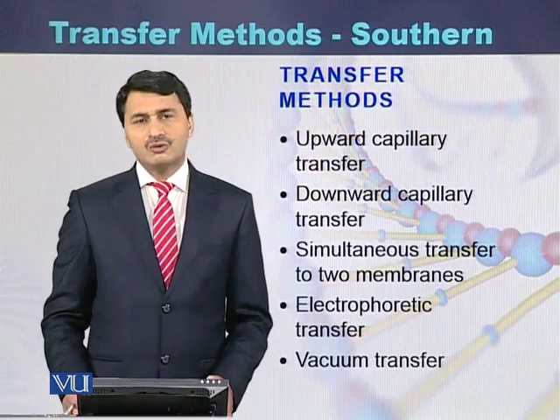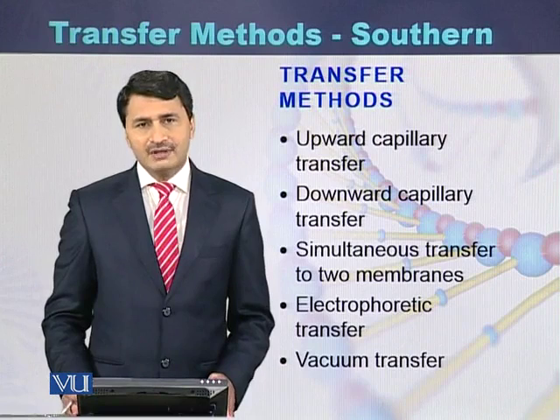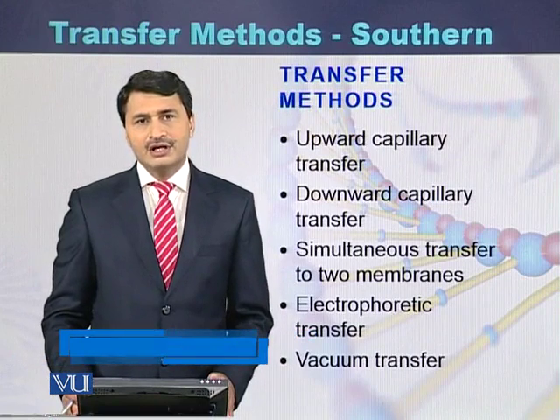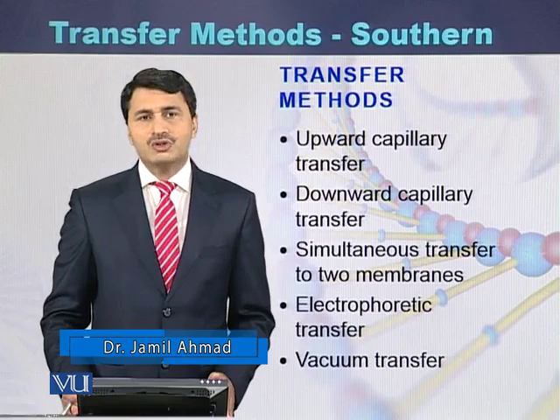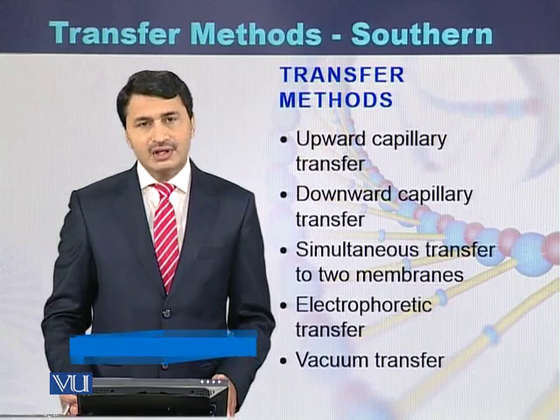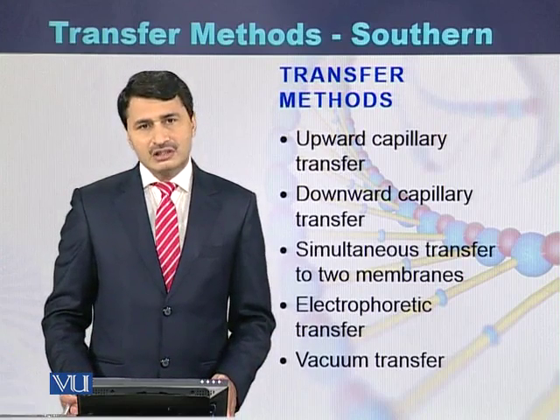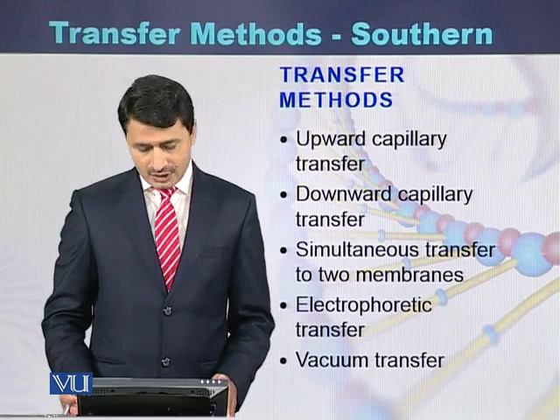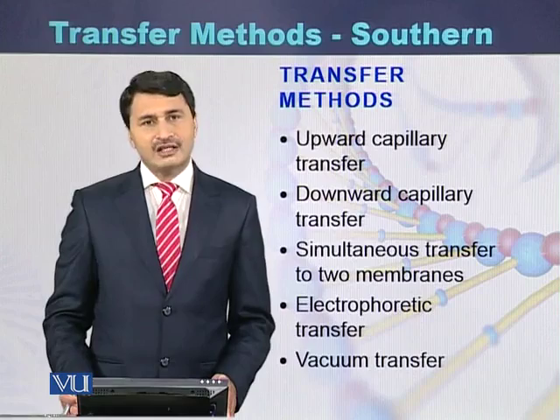So to conclude, there are different methods by which we can transfer DNA bands from the gel to the membrane. The most common methods are upward capillary transfer, downward capillary transfer, simultaneous transfer on two membranes, electrophoretic transfer, as well as vacuum transfer.